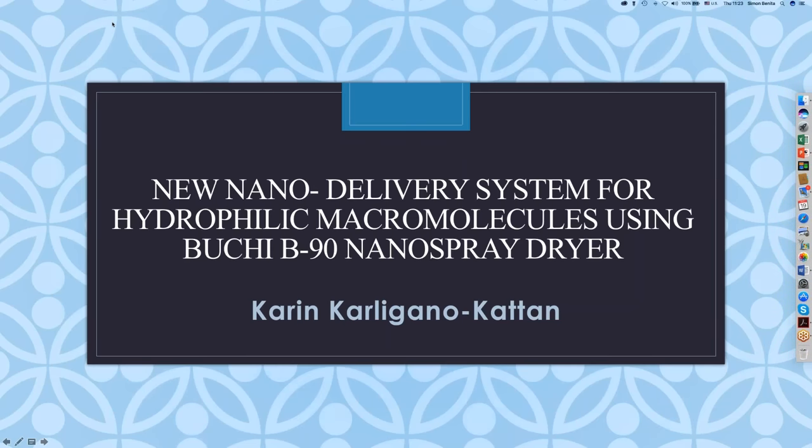Hi, everyone. I'm Karine, and I'm an MSc student in Professor Simon Benita's lab. My project focused on a new nano delivery system for hydrophilic macromolecules using the Büchi B90 nano spray dryer.